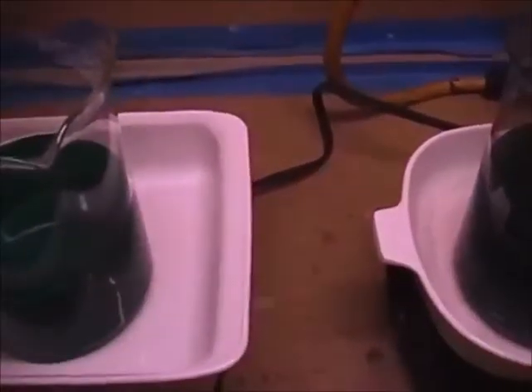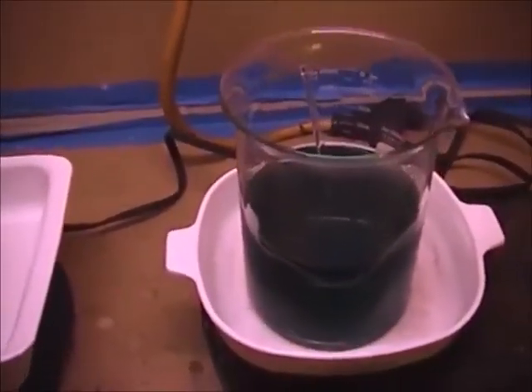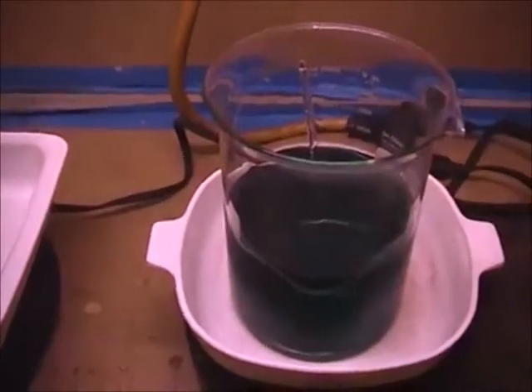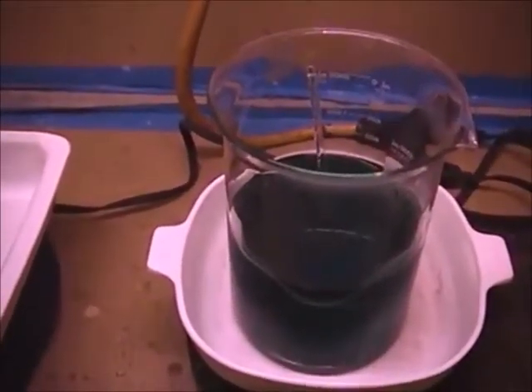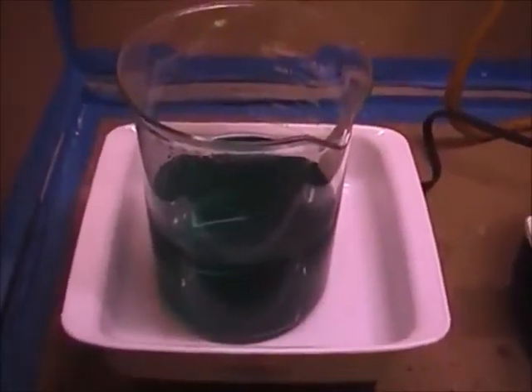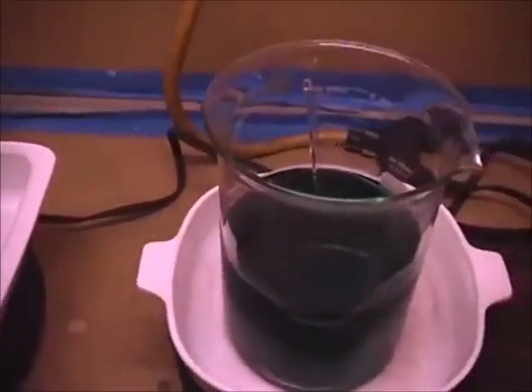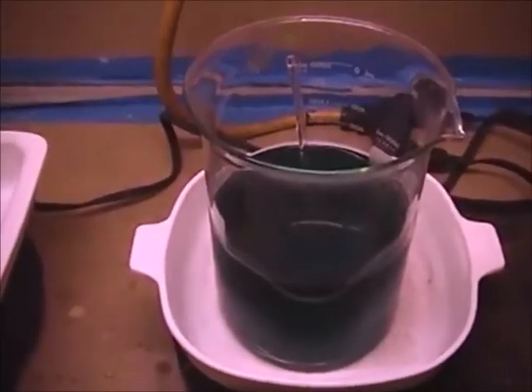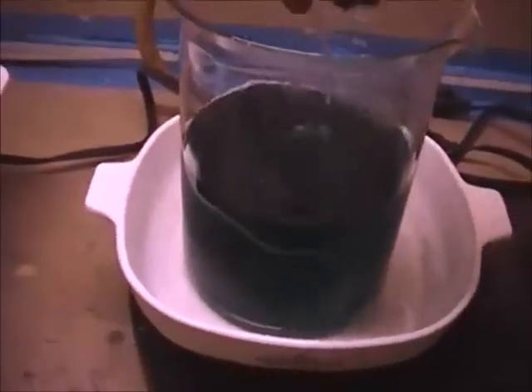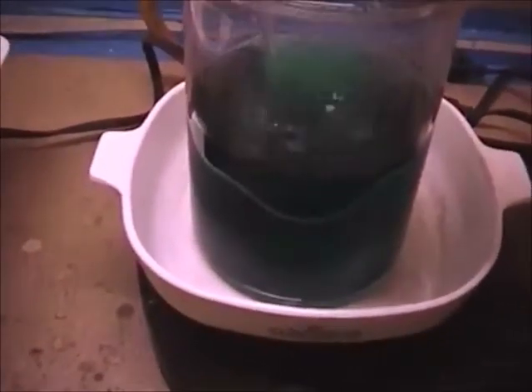Now, the reason we want to add a saturated solution of sodium formate is because when we add this, we're going to have a process occur called nucleation. And the more concentrated the solution is, the larger the particle size that is going to precipitate from the solution. A very weak solution equals very fine particulate. A concentrated solution equals a larger grain size, which should wash a whole lot easier. So, what I'm going to do now is stir this just a little bit to get it uniform.